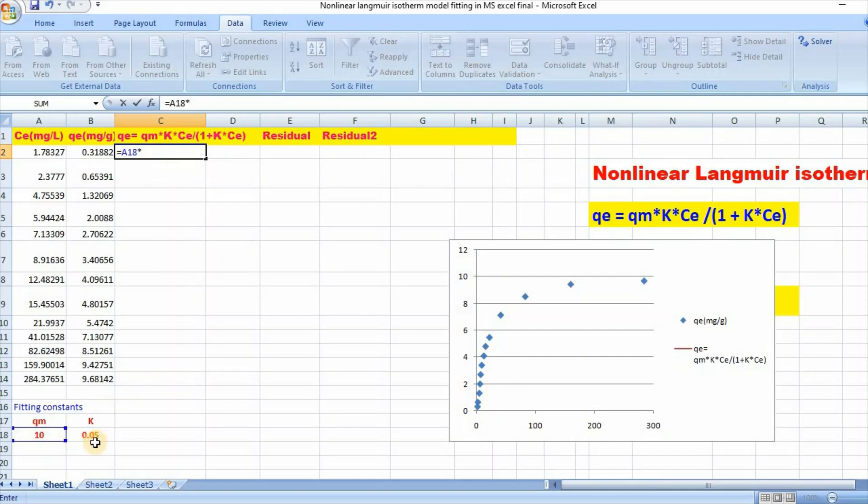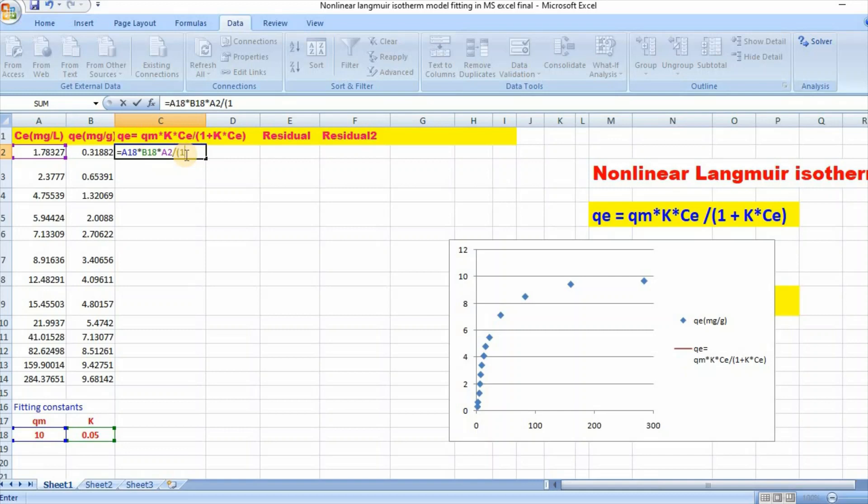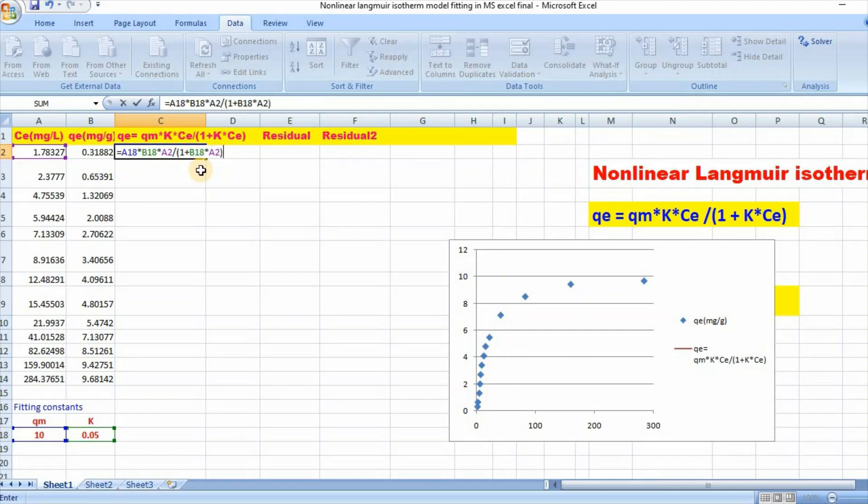...star K star Ce divided by 1 plus K Ce, bracket close. Then, as qm and K values are fixed, you need to put dollar signs for absolute cell references.